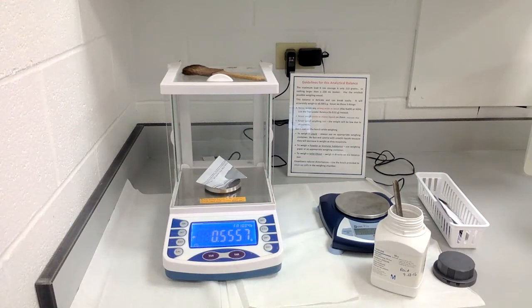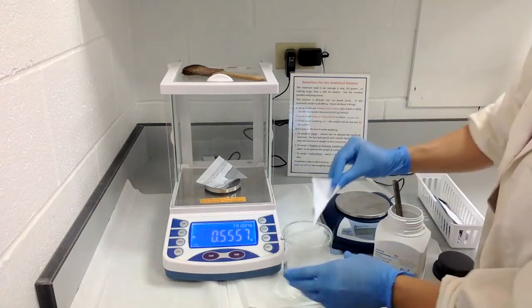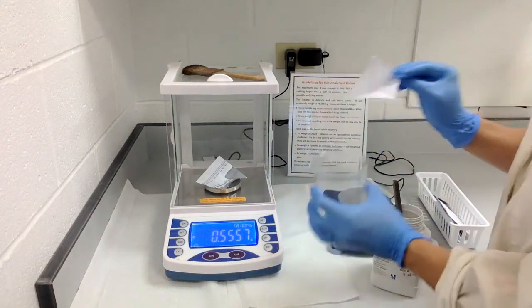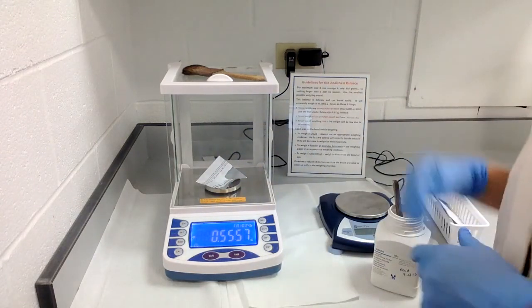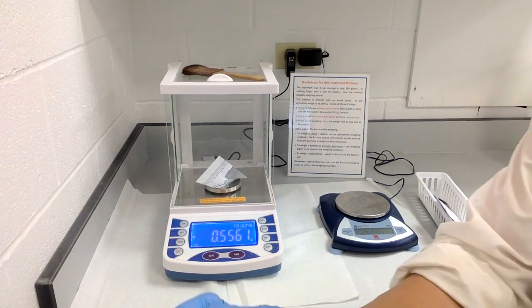If you're going to pour the sample into a beaker, those creases really help you pour the sample in. That covers the differences between the analytical balance and the top loading balance that you'll be using this semester.